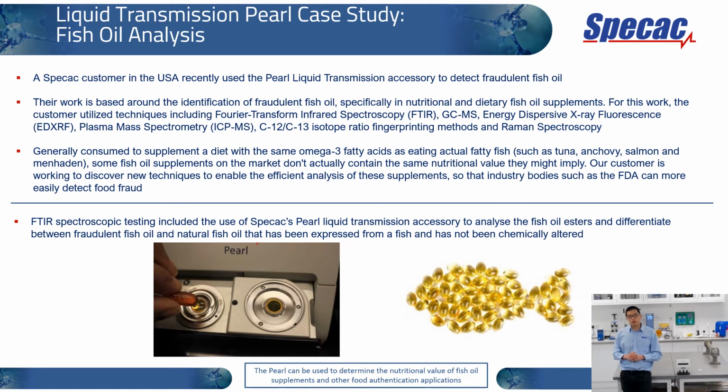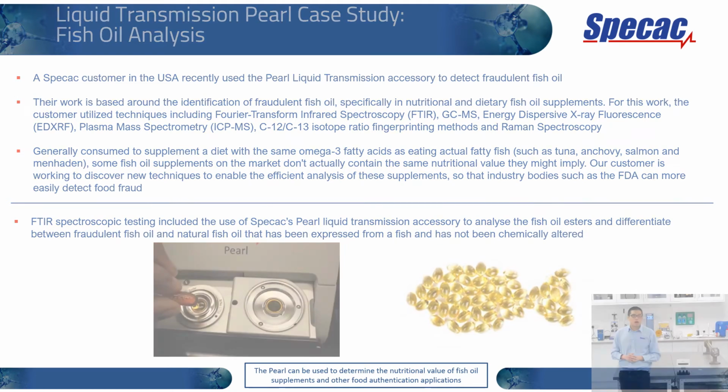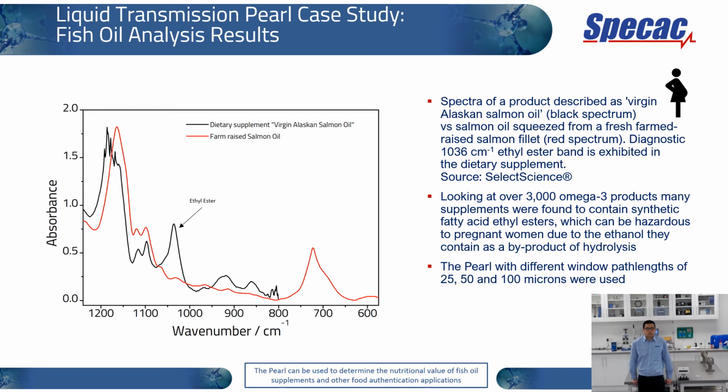And we do that by differentiating between the different ester peaks between oil expressed from fresh fish versus oil from fraudulent fish oil tablets. The reason why we're interested in this application is because fraudulent fish oil in the market could potentially endanger the health of pregnant women.